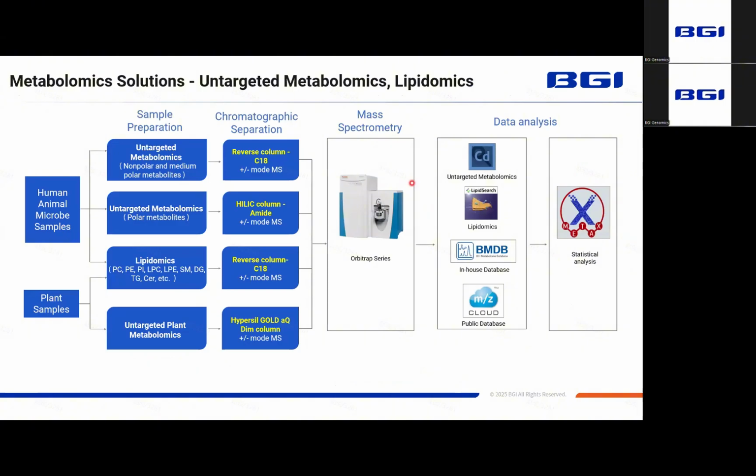For metabolic studies, there are some public databases like ChemSpider, but these databases only have very limited information for a specific metabolite, which is the MS1 spectral information. So actually, this information is not enough to 100% confirm the identification result.